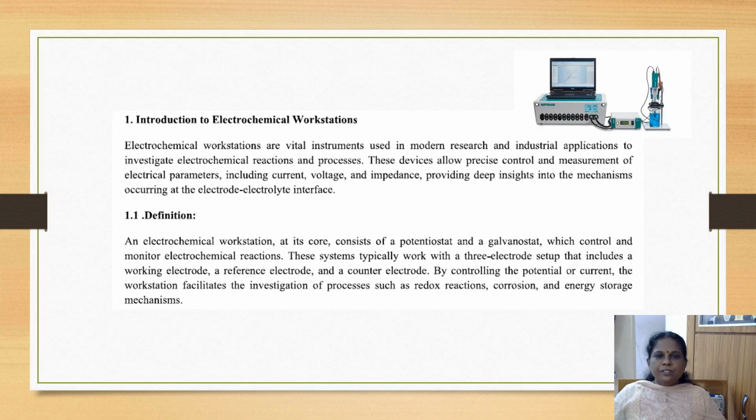Electrochemical workstations are vital instruments which are used in modern research. These devices allow precise control and measurement of electrical parameters like current, voltage, impedance, and the mechanisms occurring at the electrode-electrolyte interface. And we can define the electrochemical workstation at its core.